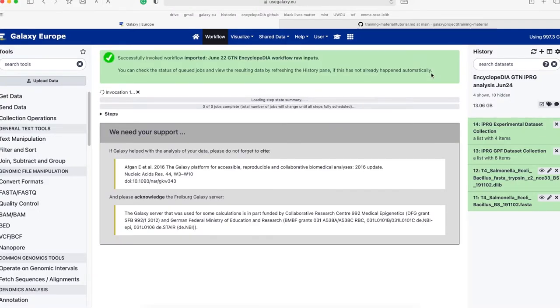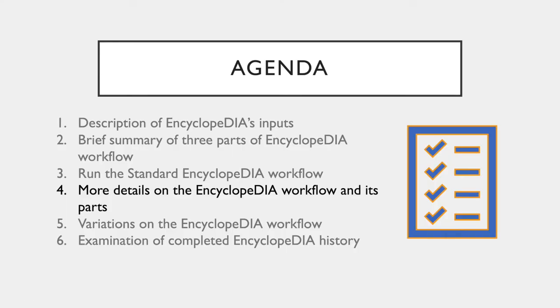Once you have run the workflow, a page will pop up with information on the invocation of the workflow as well as the progress of steps yet to be completed. The nice thing about running workflows on Galaxy EU is that they do not require constant attention, meaning you can hit Run and complete other tasks. In this case it's very helpful as the Encyclopedia workflow can take five to six hours to fully run, so you don't want to be tied to your computer for that entire time. Therefore, while we leave the workflow to run, I am going to go through the steps of the workflow in a little bit more detail.